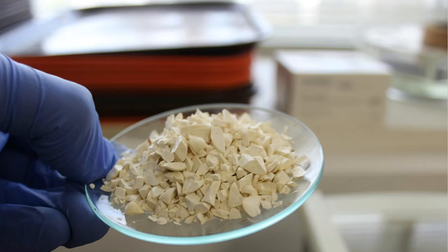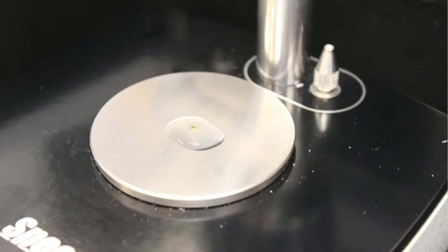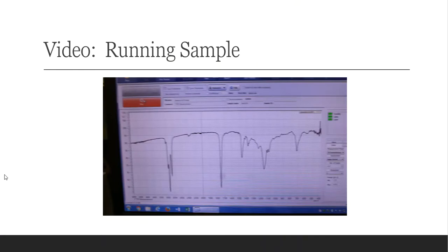Finally, the other way I'm going to confirm if I have peanut oil or not is with the FTIR. Once more, if you need the directions on how to use the FTIR or why we use it or how it works, you need to go to that particular lab where we introduced it first. And that was probably the fractionation lab. Or not the fractionation, but the ethanol fermentation lab. All right, so the plate on the FTIR, a few drops of my oil, and then I ran the sample.